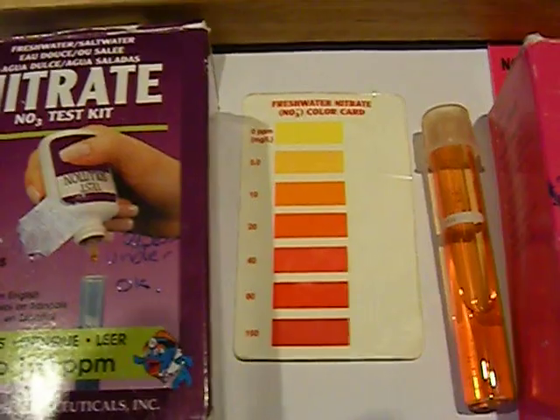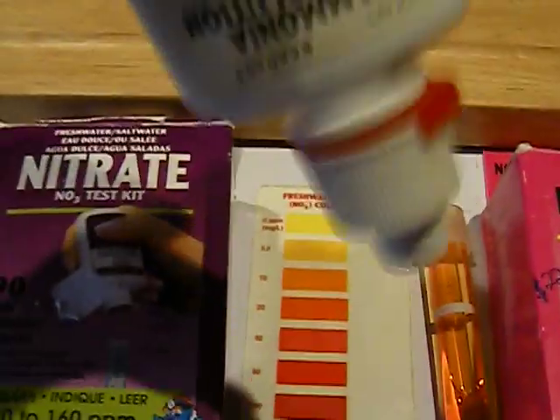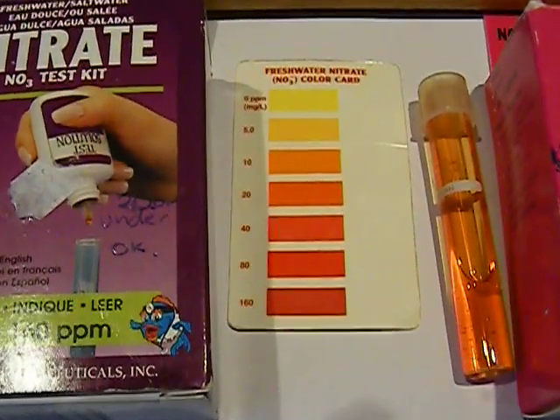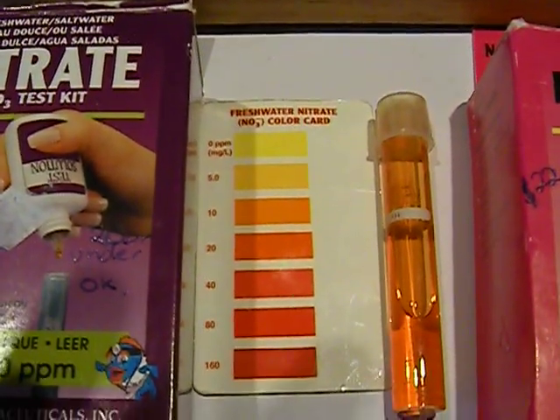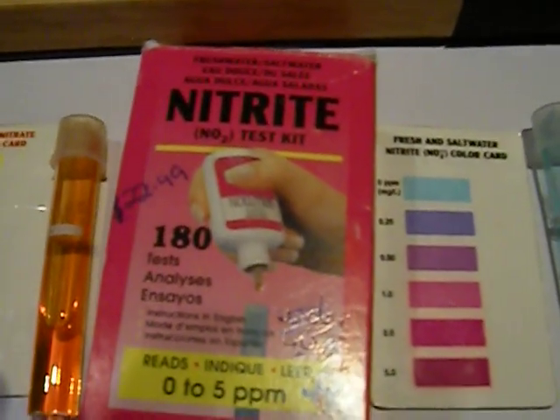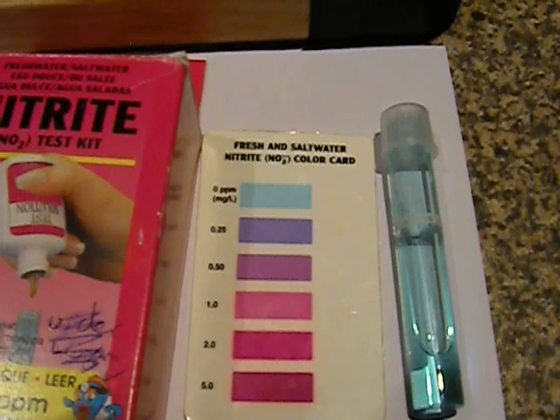This is your nitrate test kit from the same people. Same thing — fill your test tube, drop the amount into the top of the tube, and leave it for five minutes, then look at the color and compare it to the test chart.